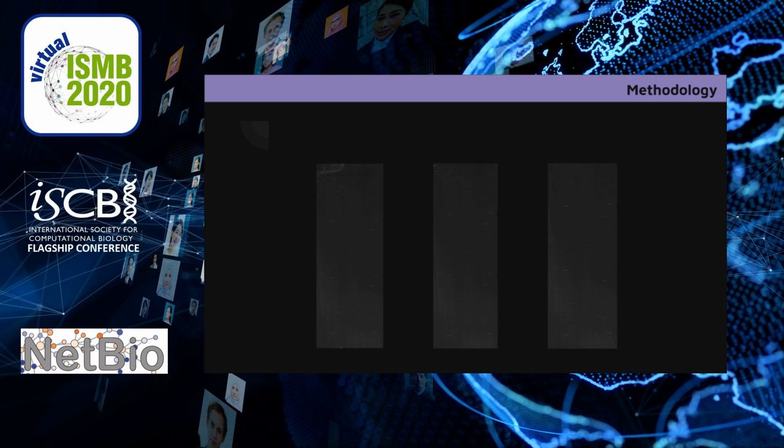The third issue is that of positional bias. In kinome microarrays, signal intensity increases towards the bottom of the array. This is visible in the array images on this slide, where it is much lighter colored towards the bottom. This can be mitigated somewhat using background subtraction, but it is still present afterwards.